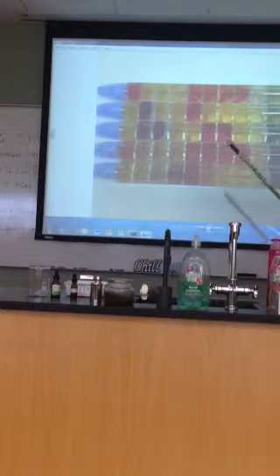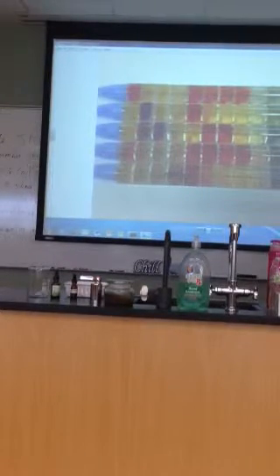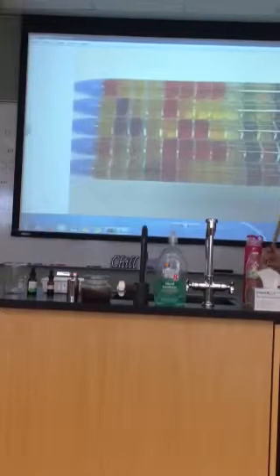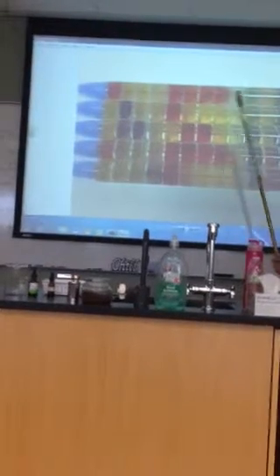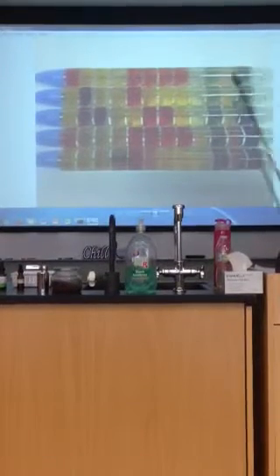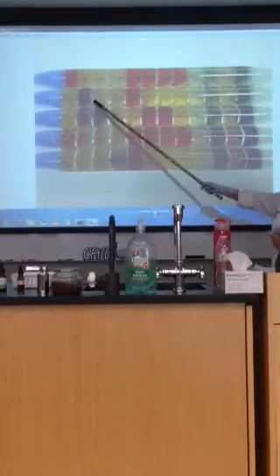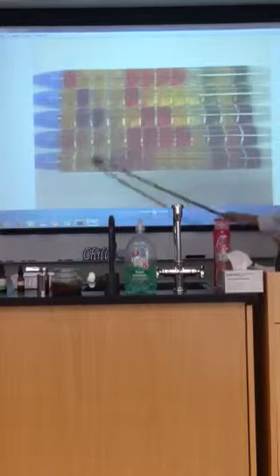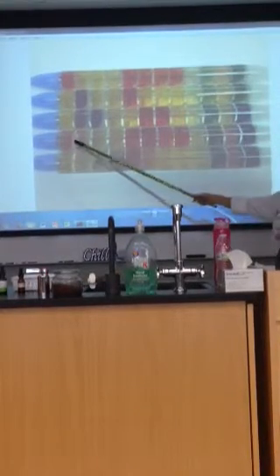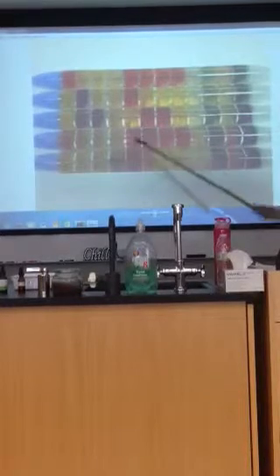Enterobacter ferments glucose. So your glucose compartment, which is down on your strip a little ways, should have been positive for everybody. If it wasn't, you might have misread it or you didn't get enough of a color change. Sometimes that'll happen. But anyway, how can we differentiate facultative anaerobes, which are Enterobacteriaceae, from this guy who does not ferment glucose?